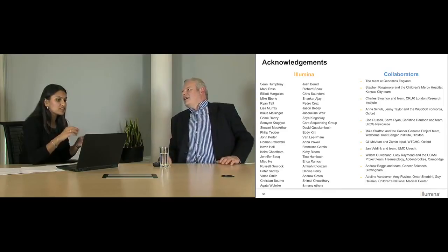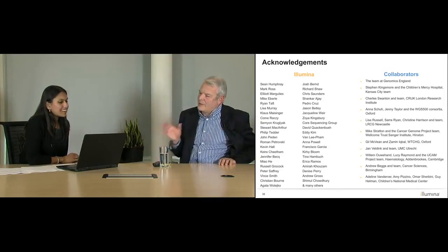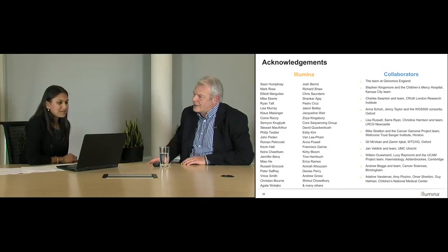Okay. Another question: when focusing on somatic mutation studies, is it appropriate to process normal versus infected tumor tissue sample or only tumor tissues? So tumor normal versus tumor only, is that... Yes, there was an infected in there somewhere. Appropriate to process tumor normal versus infected tumor tissue. Okay. Still not sure where the infected comes in, but let me answer the tumor normal versus tumor question.